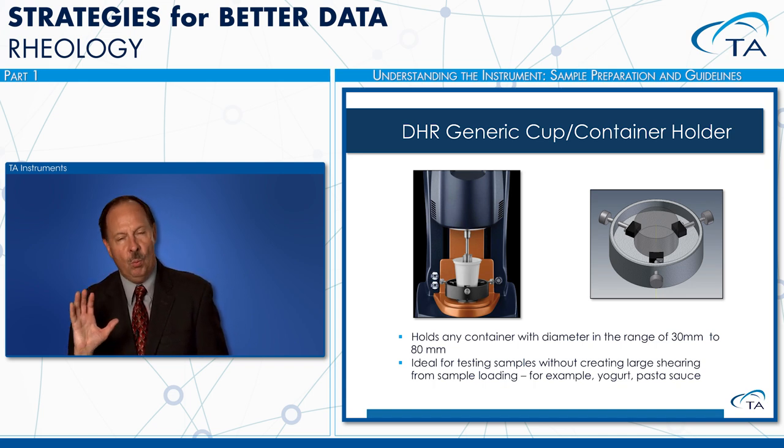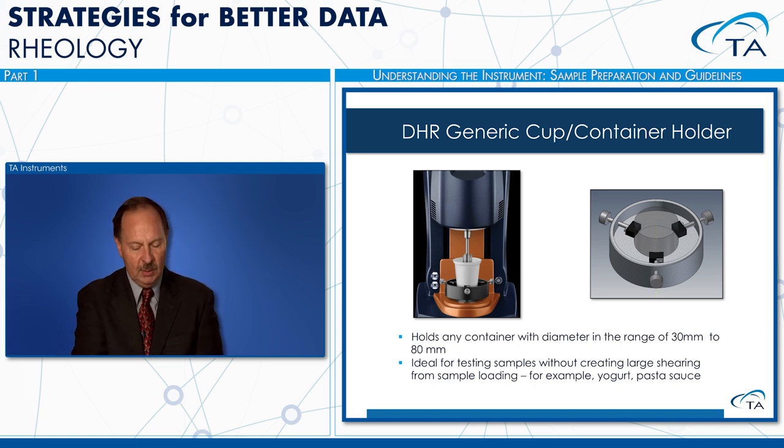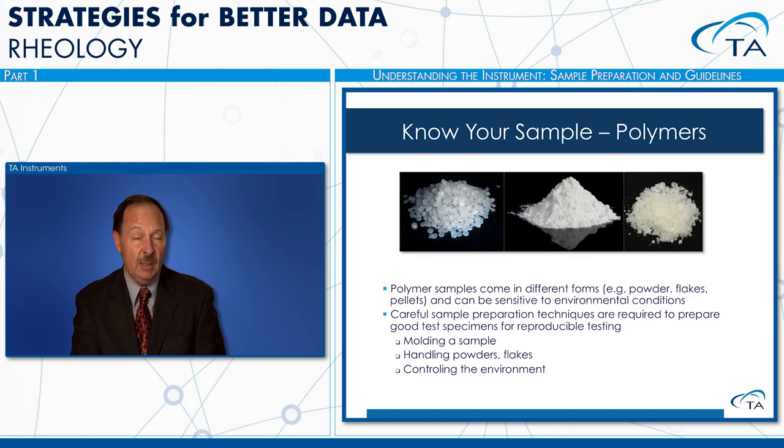If you don't even want to worry about transferring, you can get a can and just bring it there. Maybe you want to stir it, but you can test it as is atop the Peltier plate.